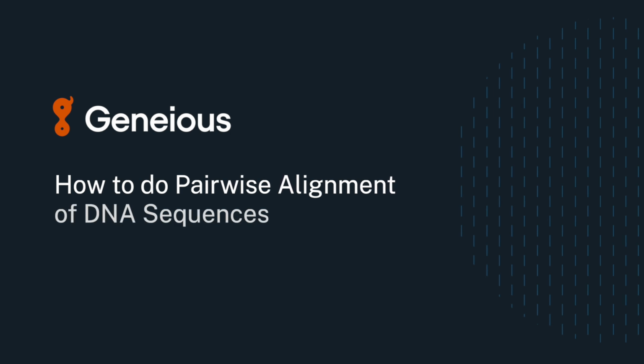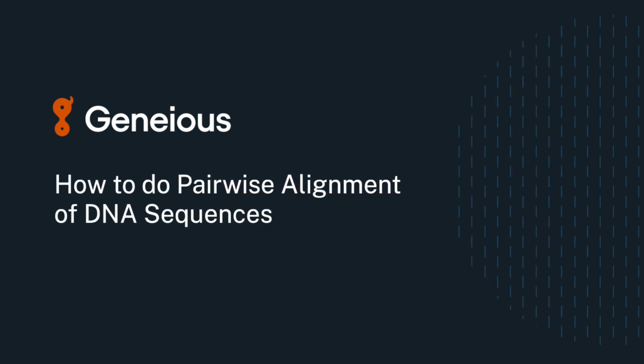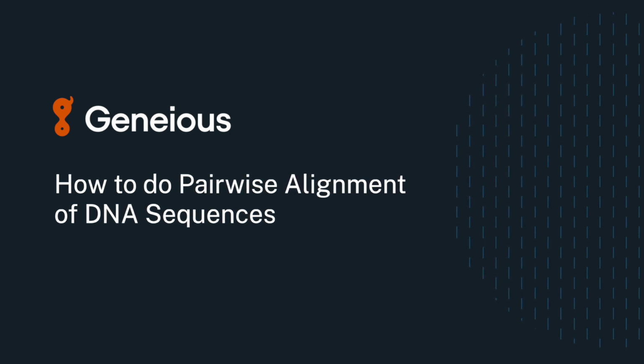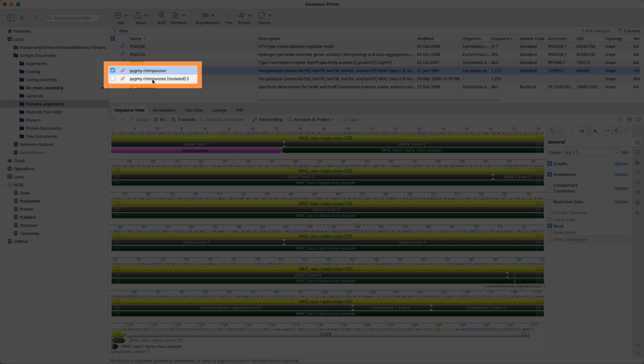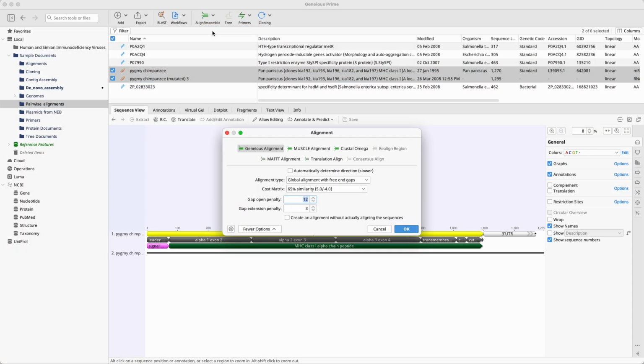Welcome to this video on using pairwise alignment to minimize gaps and maximize overall homology between DNA sequences. For this example, we will optimize alignments by altering the parameters of two related sequences. Select your two sequences, click Align/Assemble, and choose Pairwise Align.